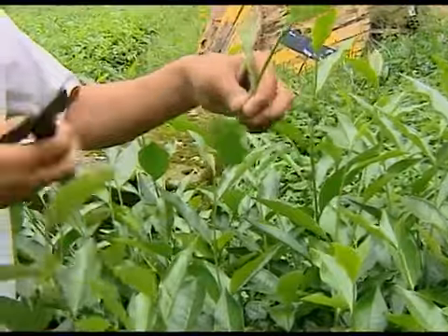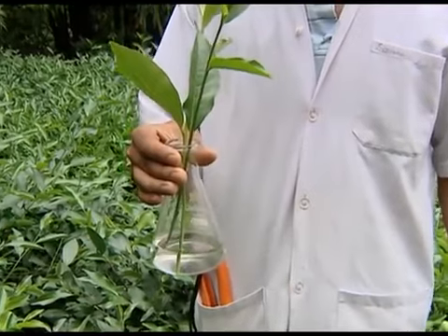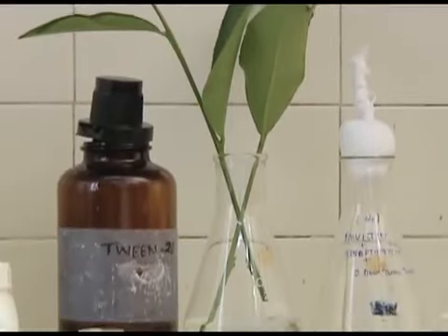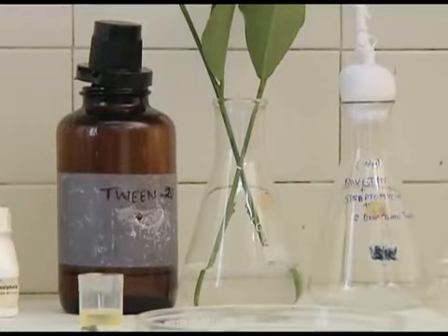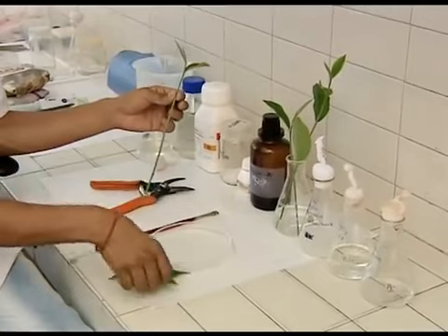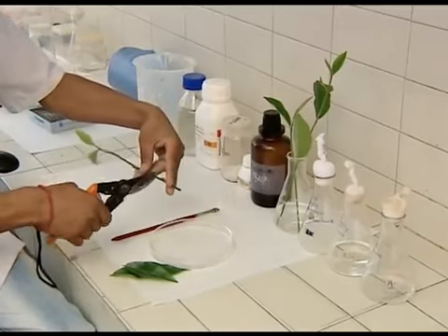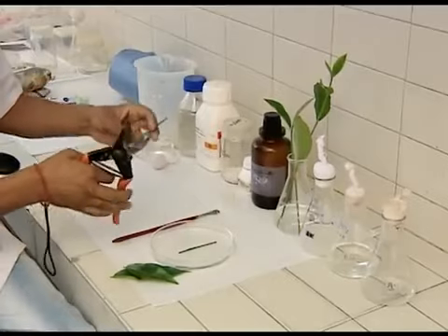Immediately after collection, the explants are placed in clean water to avoid the entrance of air bubbles, microbes, and contaminants from the cut or exposed parts, and to avoid browning due to phenolic oxidation. These explants are then brought into a laboratory for surface sterilization. For this, the explants are first cut into smaller size using a scalpel or a pair of scissors and then placed in a Petri plate containing clean water.